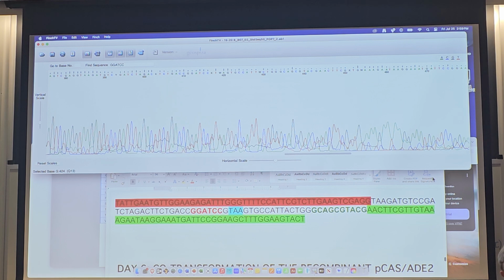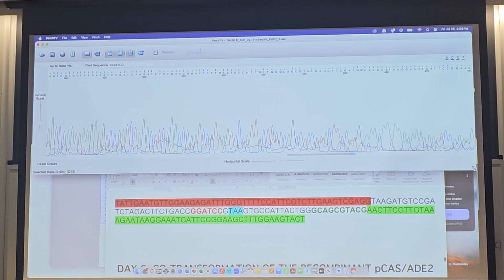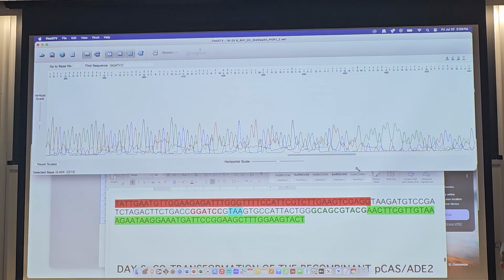So it doesn't look like it's the sequencing reagents. We also have shown that it's not the instrument because we ran some other sequences on the instrument and they look fine. So it's not the instrument. It doesn't look like it's the sequencing reagents. That doesn't leave us much to blame, and what we're left with are those columns.